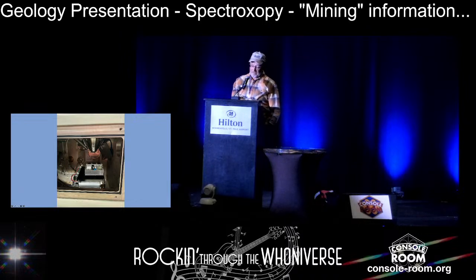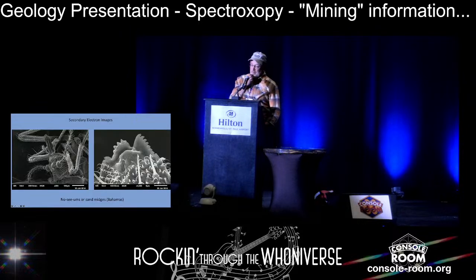But expensive mistake. So the chamber door gets closed, we pump it down, and then we turn on the beam. The best pictures you see from scanning electron microscopes typically are things like bugs, pollen, things with a lot of topography. In 2014, on the one trip we went to the Bahamas, there were particular students that were just getting mauled by these no-see-ums. And I said, if we can get one, let's bring it back. Well, we managed to bring one back. Its width across is about 2 millimeters.